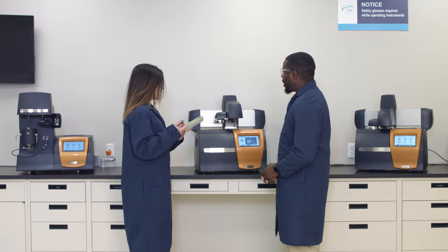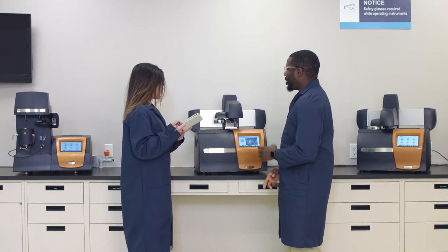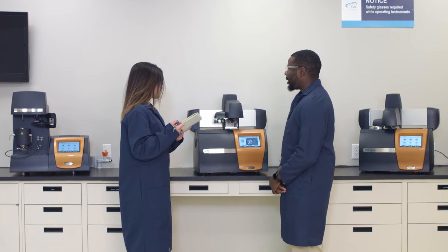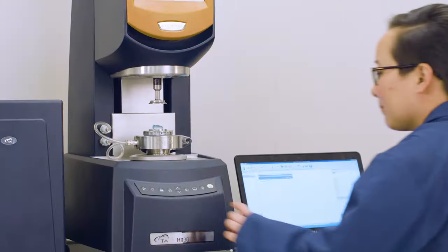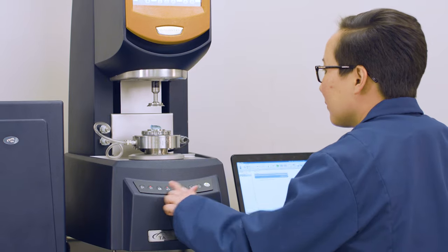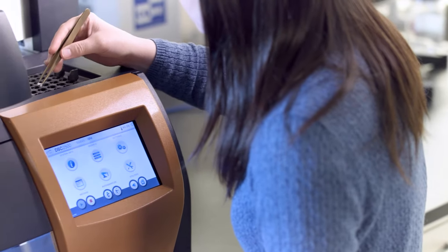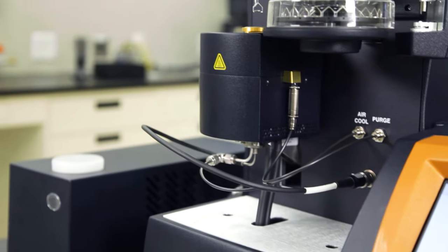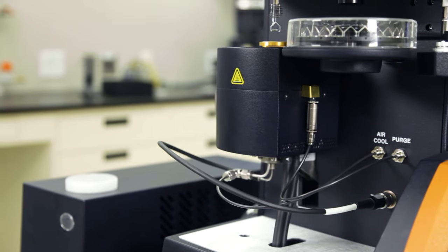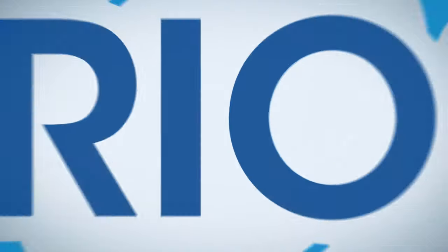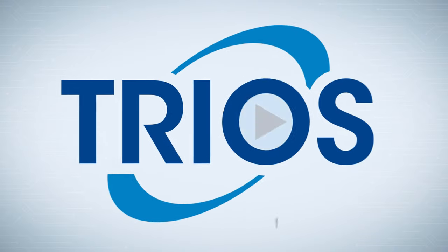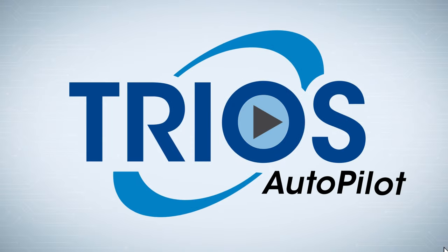Are you looking to save time and increase productivity within your lab? Unleash the full potential of your DHR, DSE, or TGA with Trios Autopilot, a premium feature for process-driven software automation.